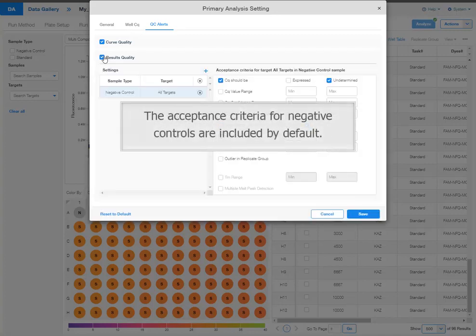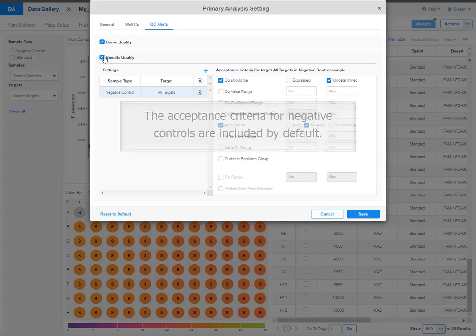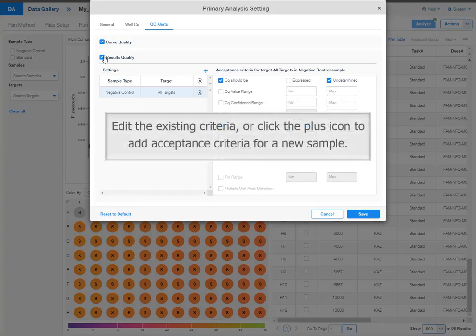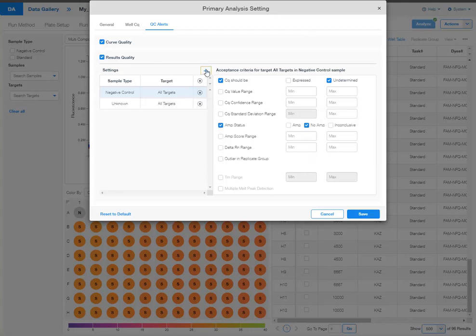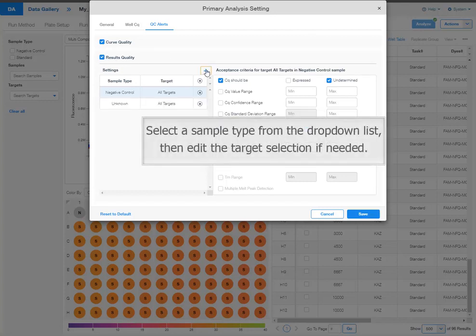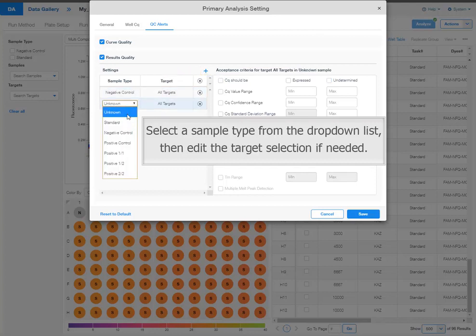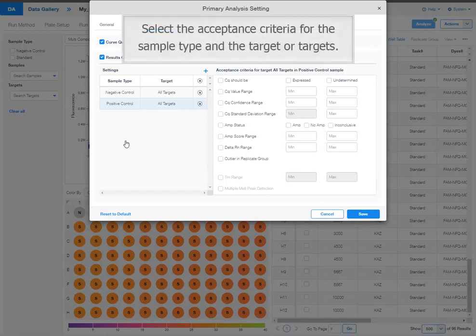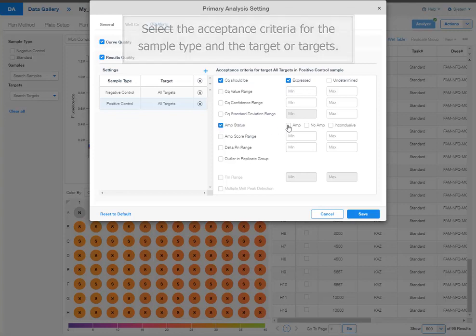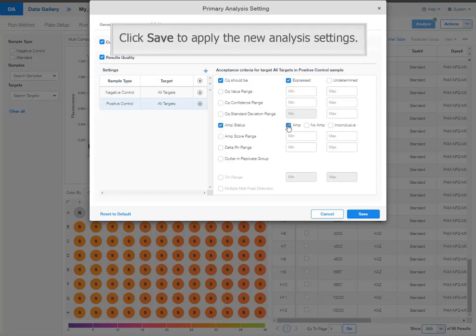Select the box to enable results quality alerts and define acceptance criteria. The acceptance criteria for negative controls are included by default. Edit the existing criteria or click the plus icon to add acceptance criteria for a new sample. Select a sample type from the drop down list, then edit the target selection if needed. Select the acceptance criteria for the sample type and target or targets. Click save to apply the new analysis settings.